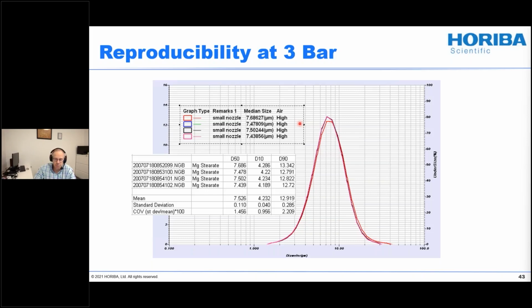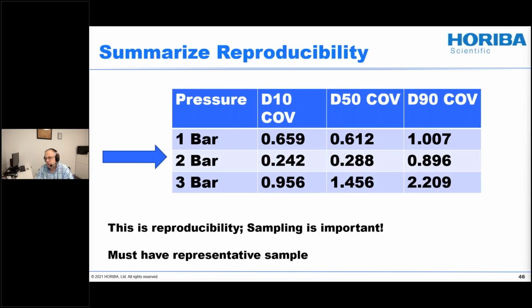So this is one of the worst cases because magnesium stearate is a fairly soft particle. If you get a ceramic, you could do anything you want. Those particles aren't going to break, and then you do get nice looking shelves. I hope that helps. If you have a dry powder feeder issue or a question, you can reach out to us, and I'll turn Amy loose to clear up your application.